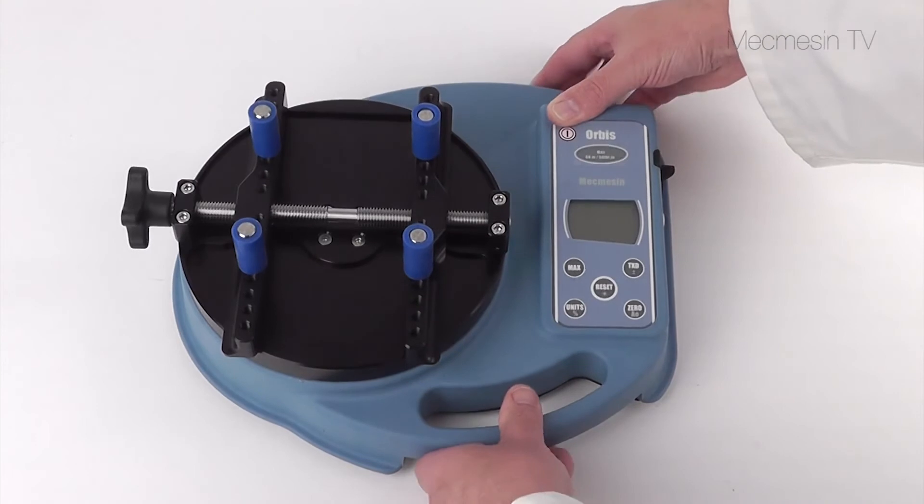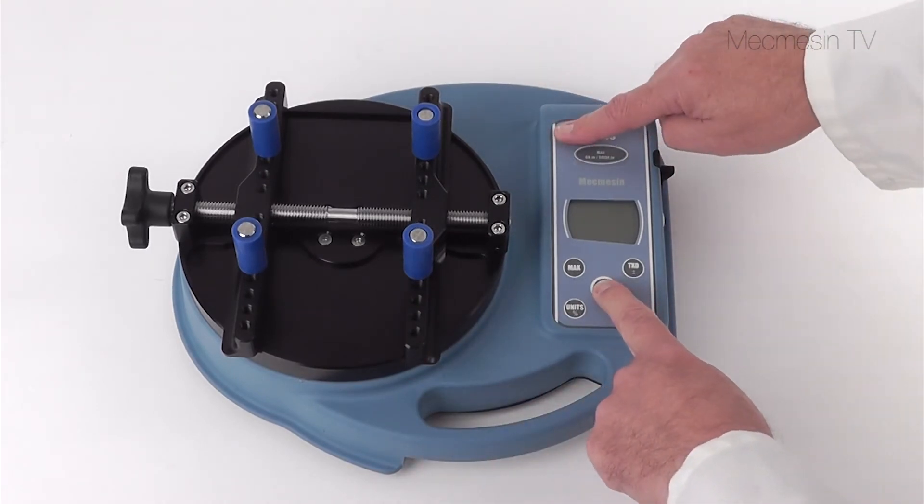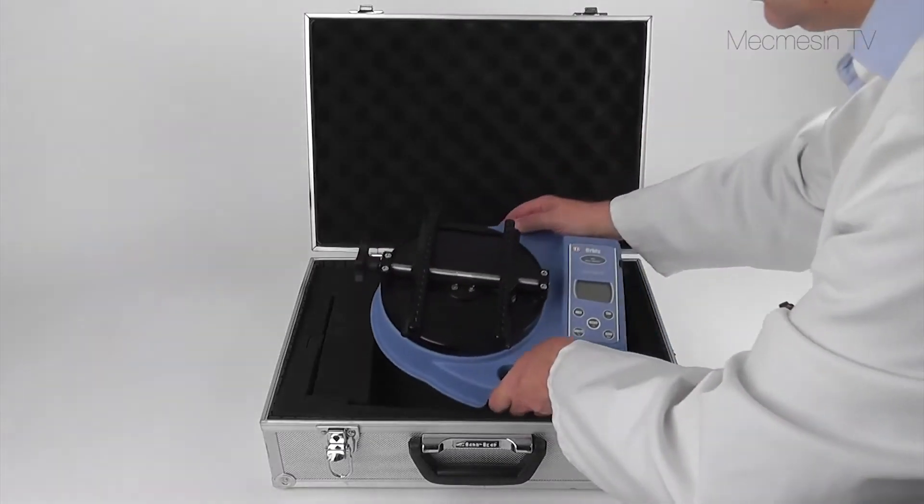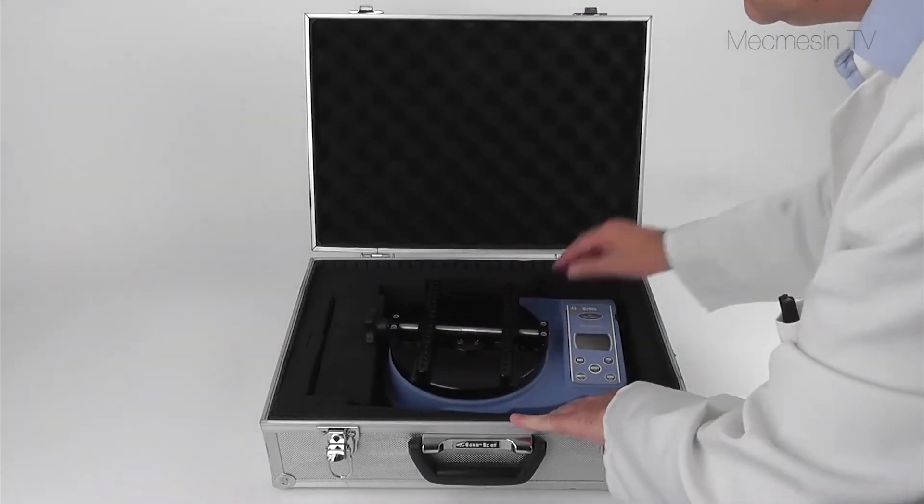The Orbis is powered by rechargeable batteries, which means it can be used even where there's no mains power. Weighing just 3 kilos, the Orbis is highly portable.